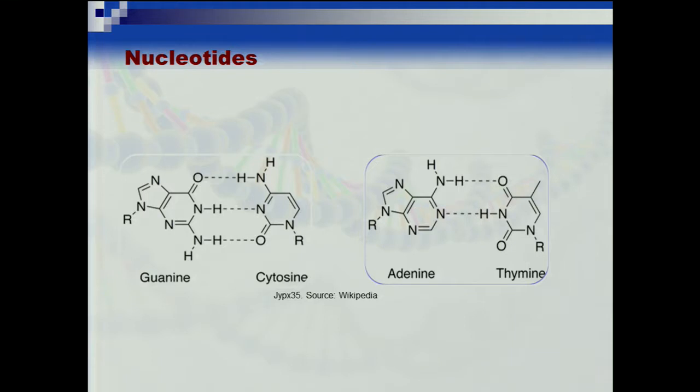Do you know what an atomic force microscope is? An atomic force microscope is basically where you get the image by touching something, but the touching force can be between atoms, just the plain force. If it is a plain force, that is known as atomic force. If the force is generated by chemical bonds, then it is known as chemical force. If it is generated by magnetic forces, it is known as magnetic force. So, anyway, here you need these chemical forces, and then you could measure them and kind of track it down.